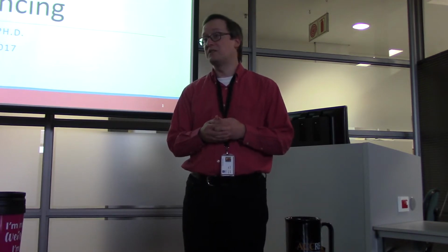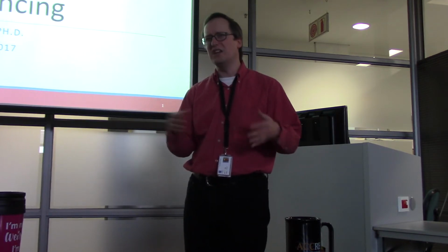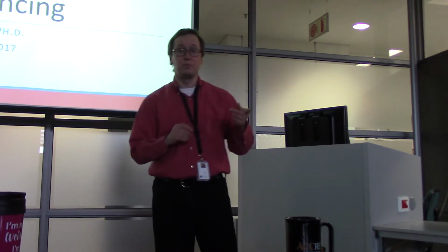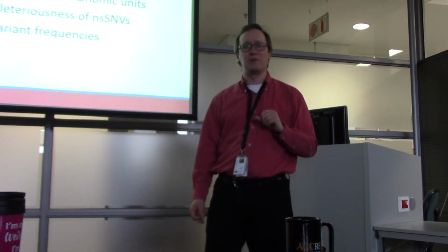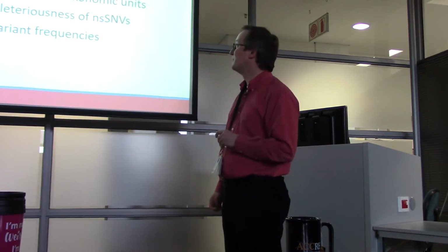And so I've spent a good week now just digging through what papers exist out there, what data resources exist out there, and I think I have some pretty good news to tell you about what's available in the algorithms to support Amplicon sequencing. So we're going to start with a talk about PCR primers. Everyone loves designing PCR primers, right? Well, there are tools out there to help you, and we're going to talk about a couple of them.